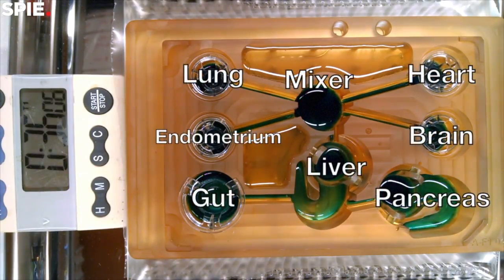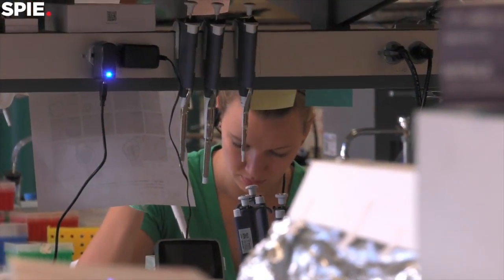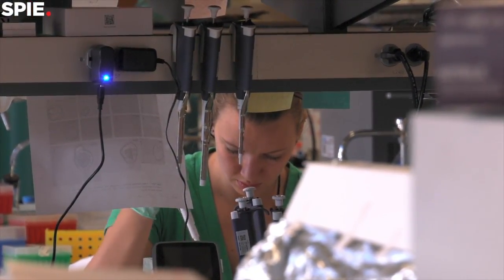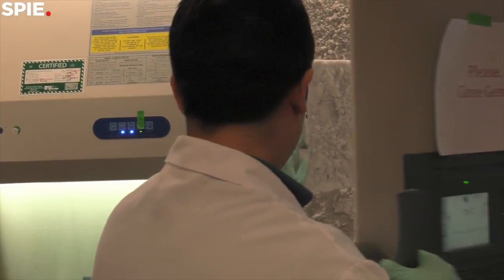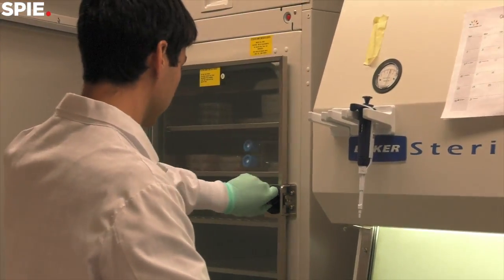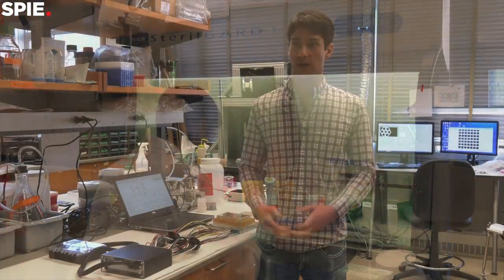So, we have a team of people for each organ to do development of the tissue, develop biomarkers so that we can track and understand the health of each tissue, even when they're all mixed together, so we can pick out the different components of each. So, we have usually a postdoc and a lab technician doing the development for each tissue. Those people will come together in a coordinated dance where we combine them all into this hardware system that we've developed to fluidically link all of the systems together.